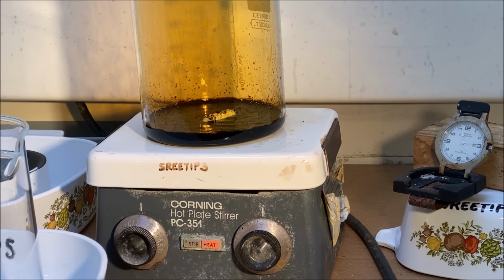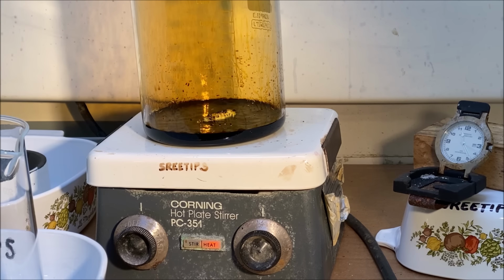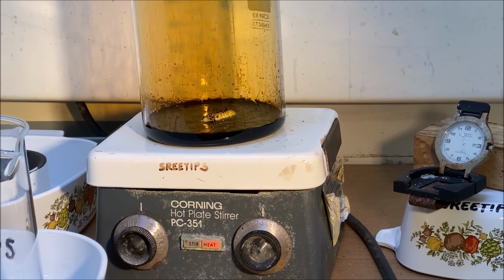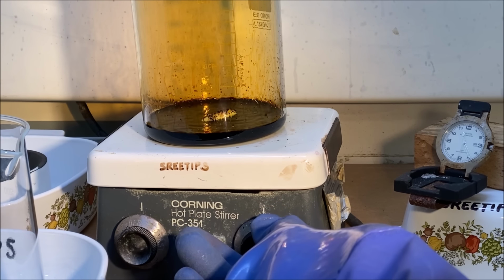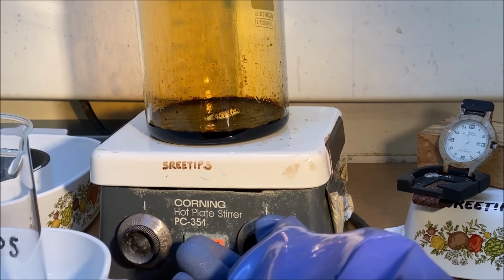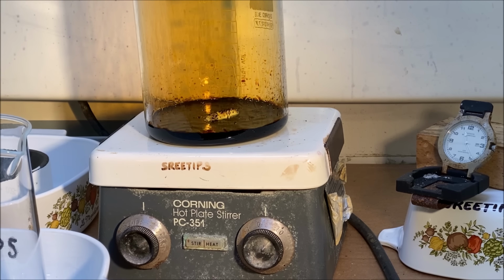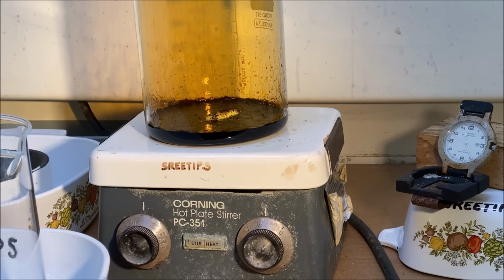I've been evaporating the solution for about 14 hours now, trying to get those fumes to clear up like in a gold refining, but of course this is platinum and I can't get those fumes to go away, so we're going to call it here. I've got it down to 100 milliliters of liquid. I've got probably an ounce of platinum in there. So I'm just going to conclude that all the nitric has been driven off. I'm going to cool this down, and then we're going to go from there.